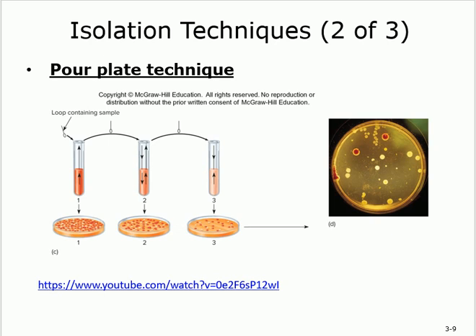So it is spreading already without needing to streak. You just pour it. Just mix it like this, and then you start to study it. So this is the pour plate. You pour it into different spots.